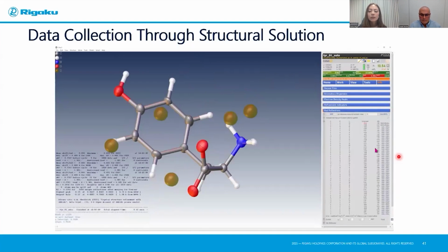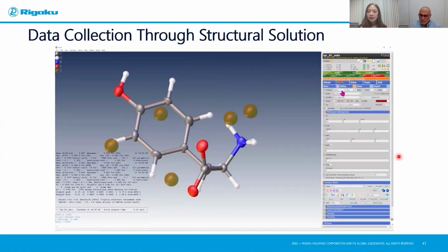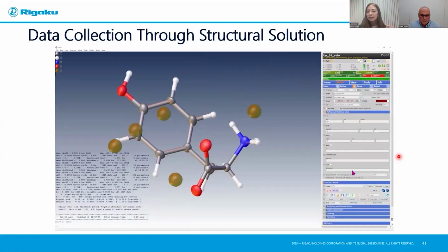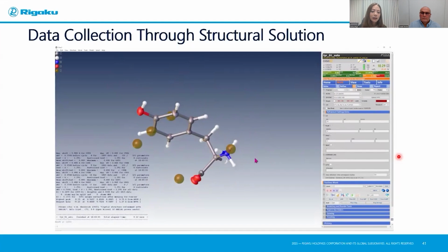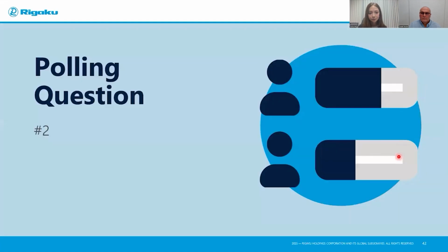This is for electron diffraction data, a really nice kinematically refined structure with an R1 of about 10.5%. So this full process from screening to actually getting this refined structure, in this sort of best case scenario with a standard sample, was about 8 minutes. And so it can be this straightforward in some cases to actually get your final structure.